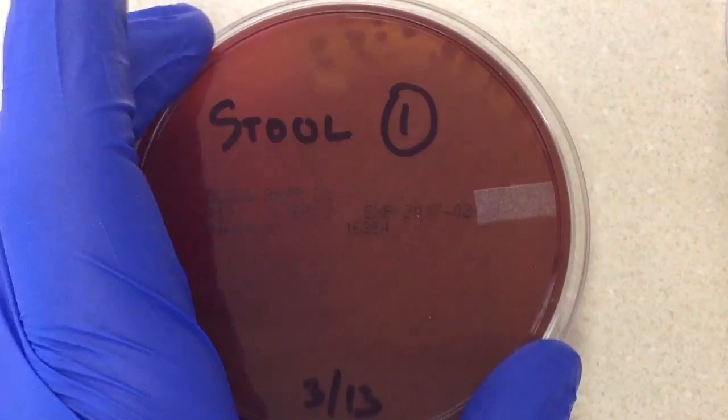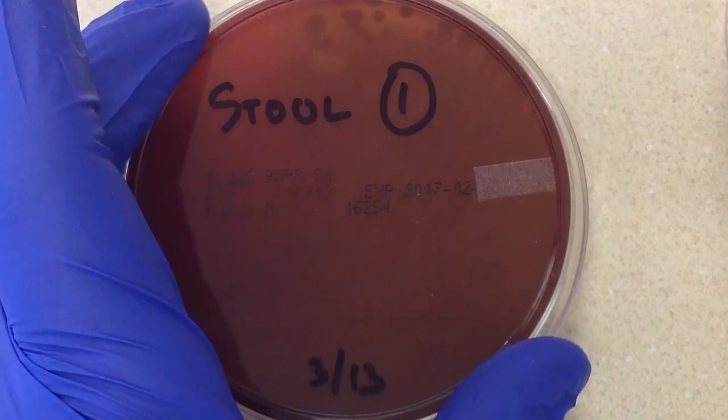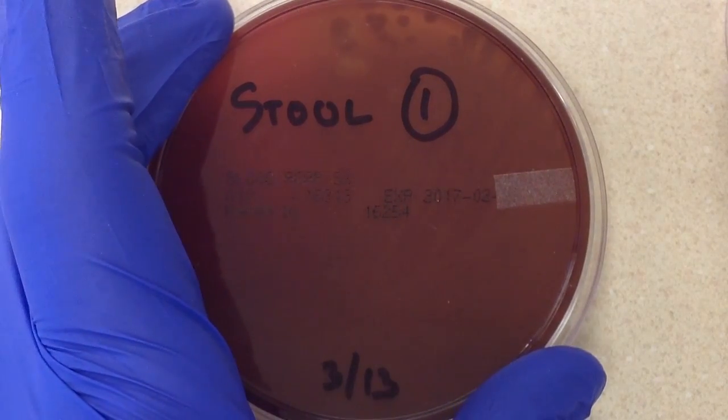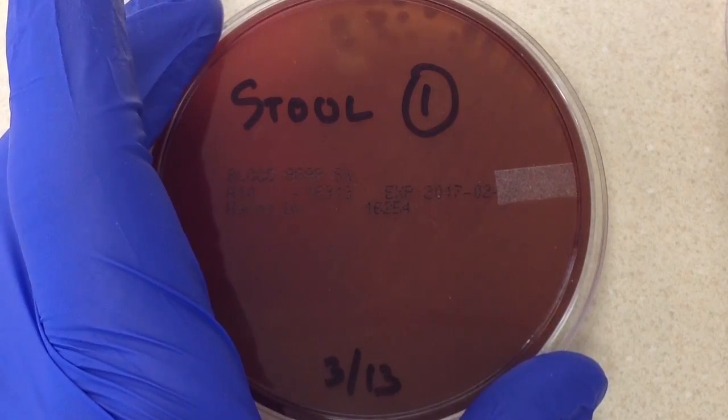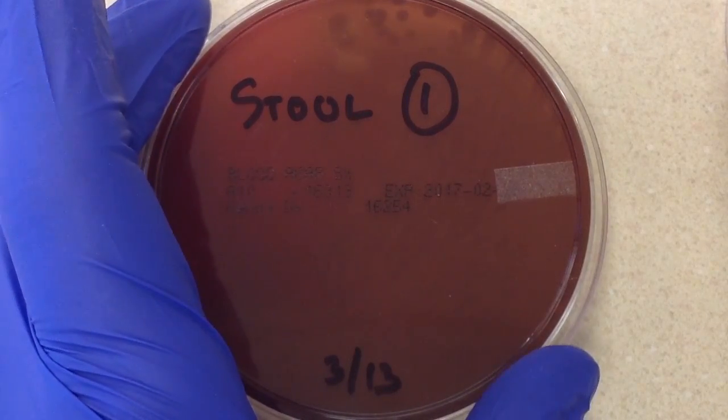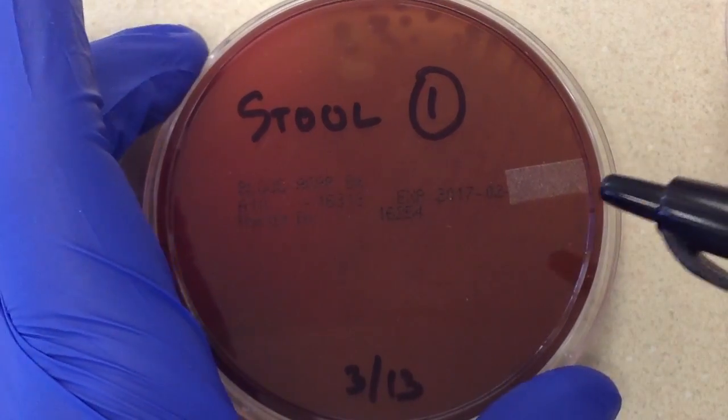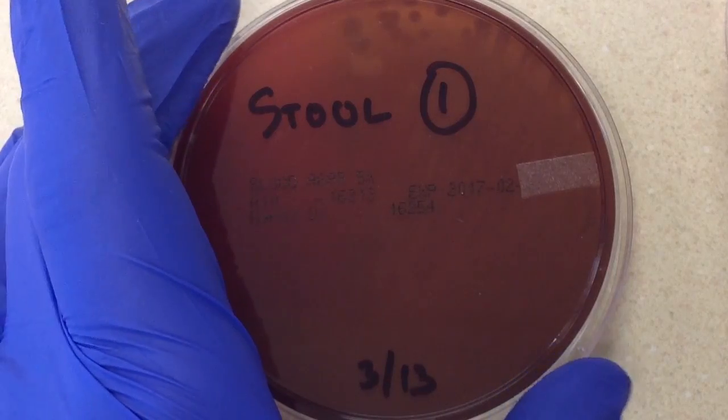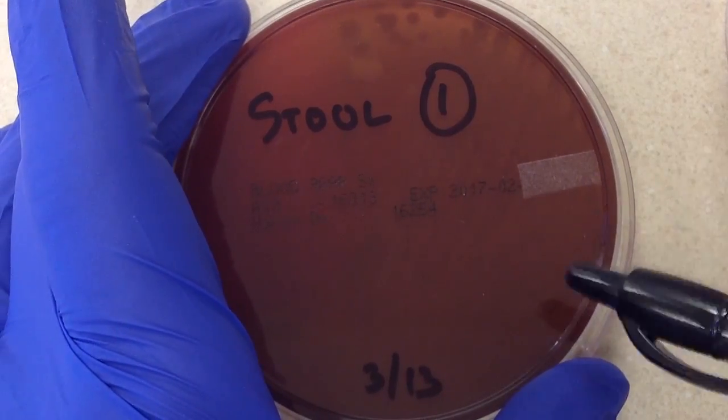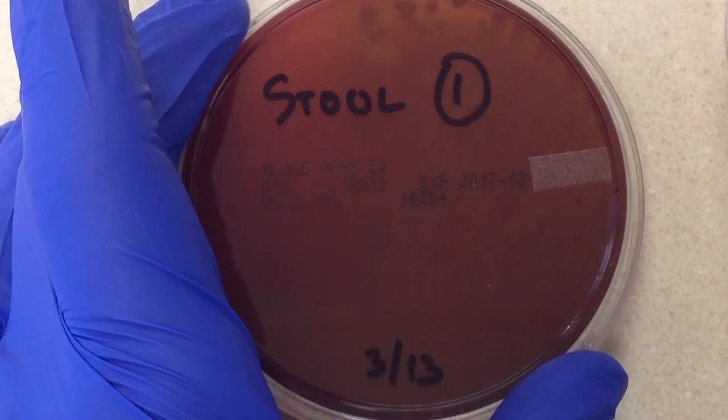Let's take a look at our sheep blood plate. The common pathogens for stool are Salmonella, Shigella, E. coli O157:H7, Campylobacter jejuni, and possibly even Staph aureus or Candida species, Candida albicans. Of all the ones I've listed, they're pretty much all going to grow on sheep blood. The only one would probably be Campylobacter.